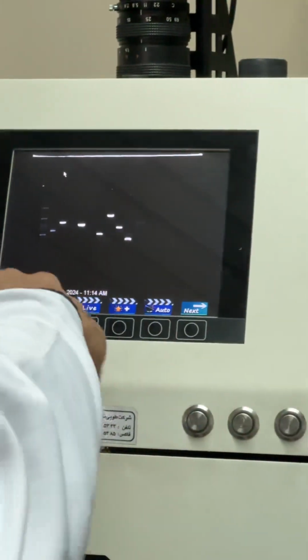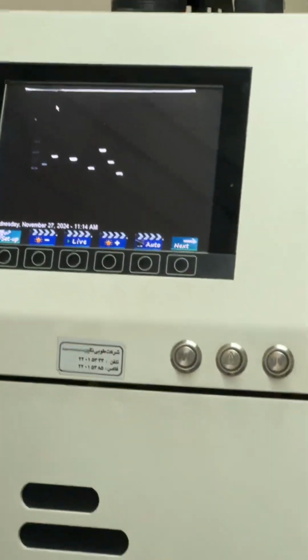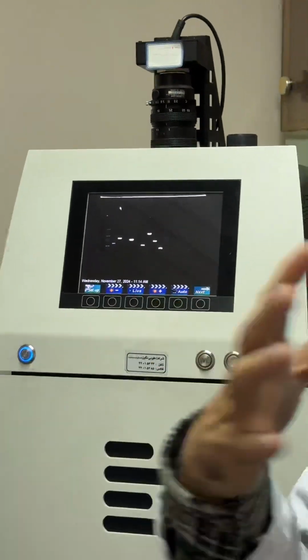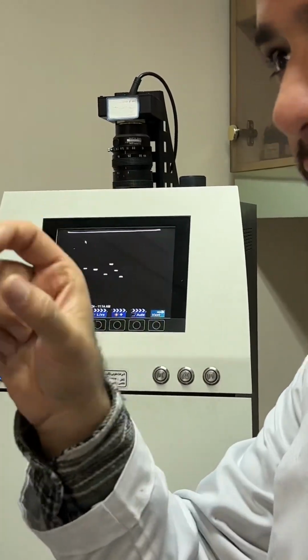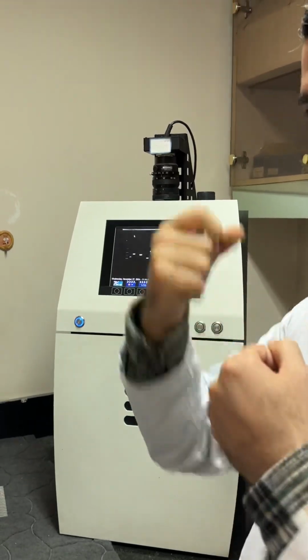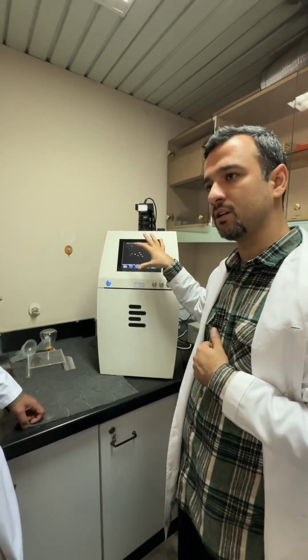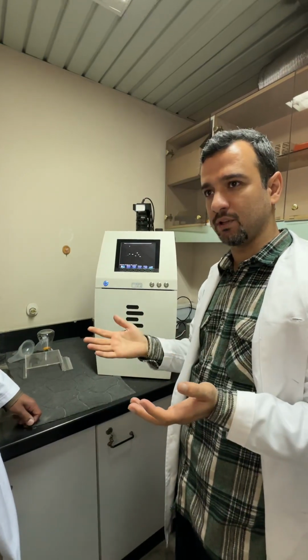Every patient has bands. This band is a result of that machine. There is the result of amplification. And this means that inside her or his body there is DNA of the bacterial or viral infection. We get that DNA and use the PCR, and with this dock, we can check the amplification. Okay, very simple.